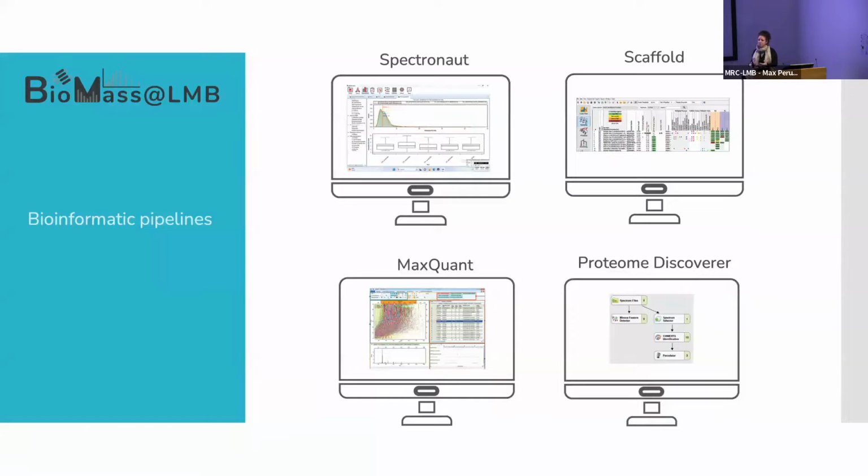Right, so what I want to do today, and I'm just going to repeat this, is a live demo of Proteome Discoverer, and I've chosen 3 different types of project: band analysis, an IP analysis, and a TMT set. Feel free to stop at any time. This gets more interesting if you ask questions, like, can I search for this or can I look at this? Because then I can do this live for you. In the future, we'll probably have workshops, so you can come with your PC and do your analysis. But for now, I'm just going to present how PD works.